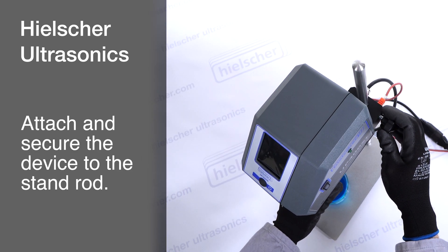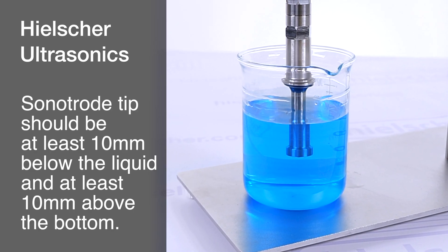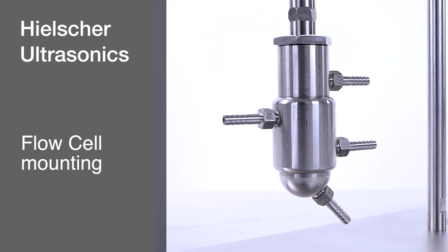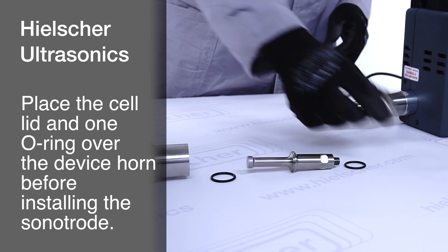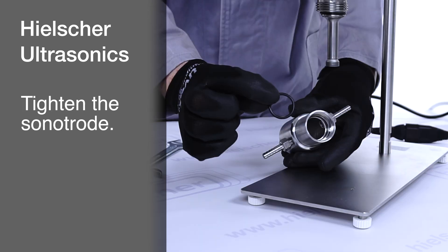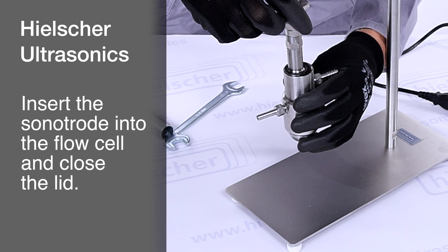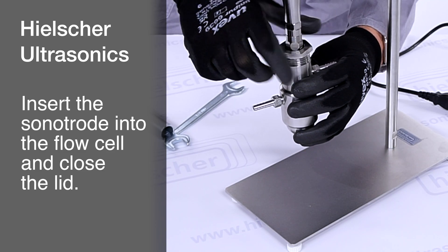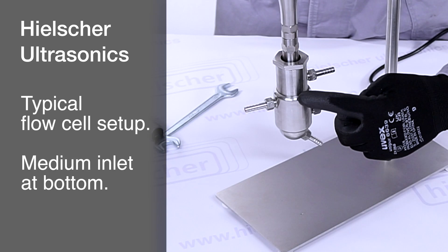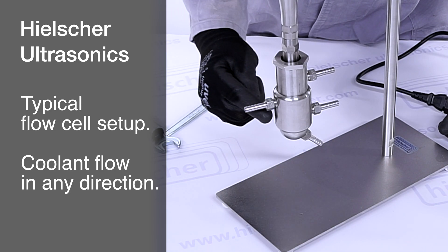Attach and secure the device to the stand rod. The immersion depth of the sonitrode should be adjusted so that the sonitrode tip is at least 10 millimeters below the liquid surface and at least 10 millimeters above the bottom of the container. If you have purchased a flow cell, such as the FC22K, please place the cell lid and one O-ring over the threaded connection before installing the sonitrode. Once the sonitrode is tightly mounted, place the second O-ring into the designated groove in the flow cell. Insert the sonitrode into the flow cell and close it, ensuring the O-rings are correctly seated to avoid damage. When using the flow cell, the medium should typically be introduced from the bottom inlet and exit from the top side outlet. The cooling jacket can be supplied with cooling water from either side inlet.